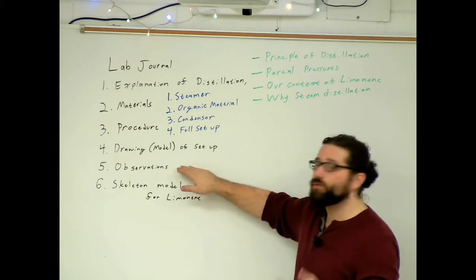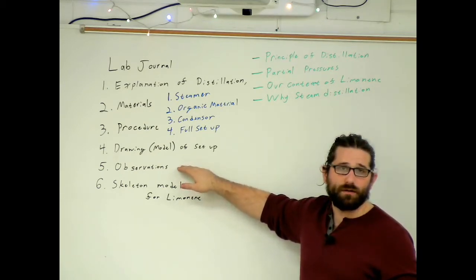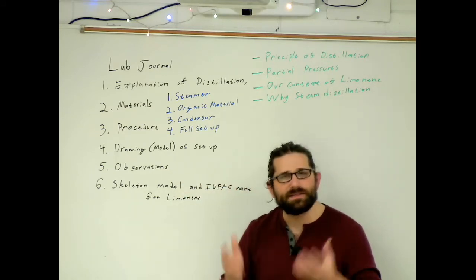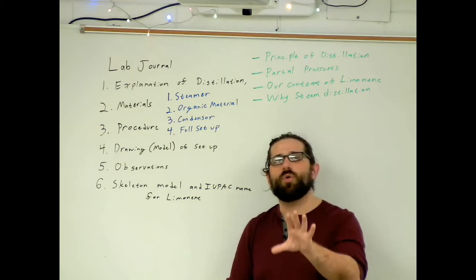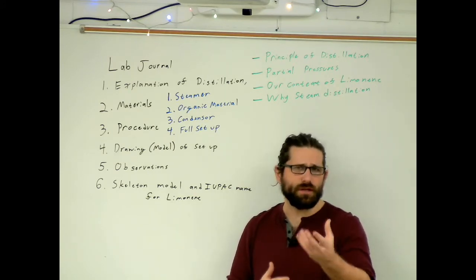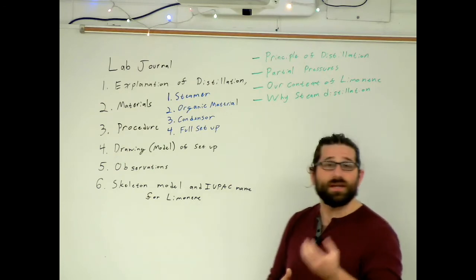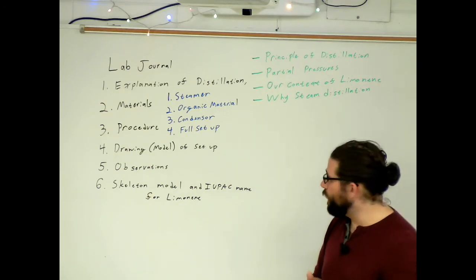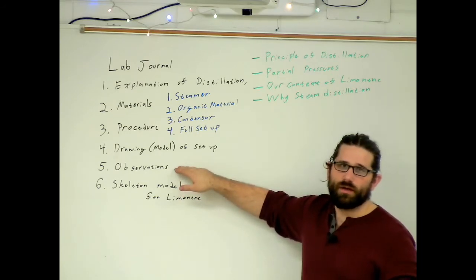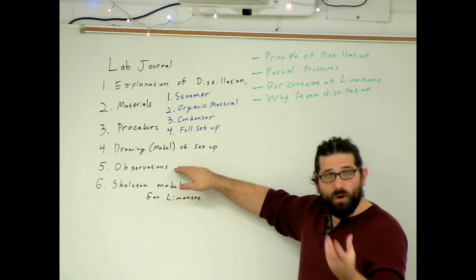Next, you'll be writing up any observations you make. You'll be watching this go through, and a lot of this will have downtime. As the distillation runs, it doesn't require a lot of input from you. You'll have time to do other work, continue studying your IUPAC naming rules and conventions, and continuing to learn those. But while this is running, you should be able to make some observations. I'm expecting some good quality observations here.